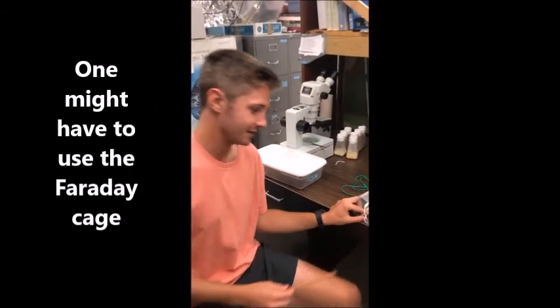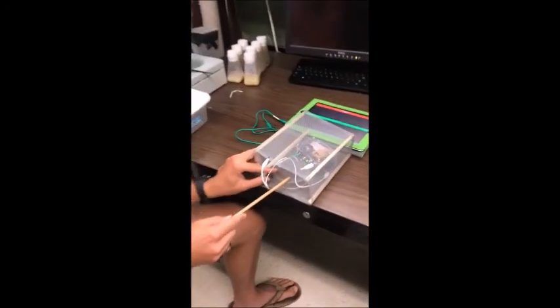We're now trying a crab leg that was taken off a blue crab, and we're getting some activity.